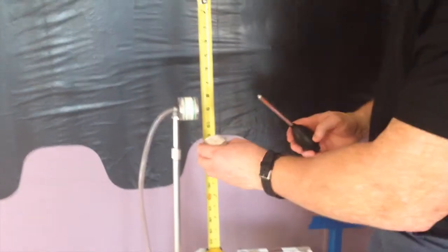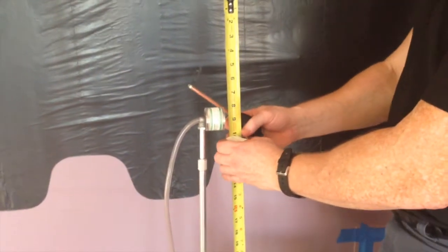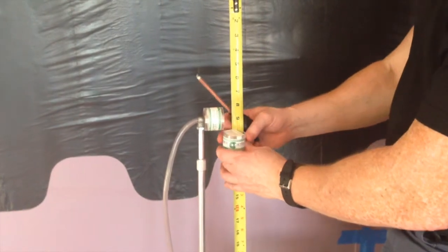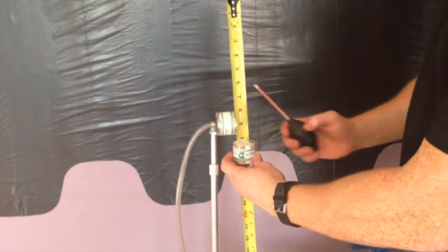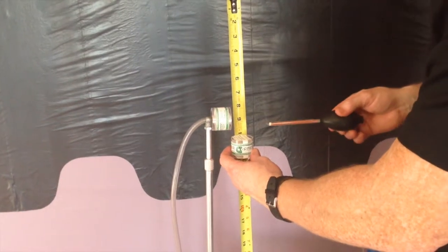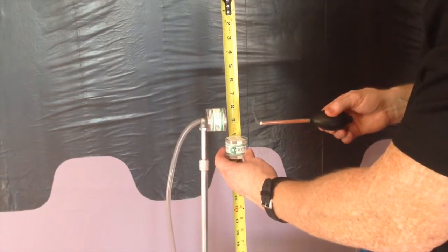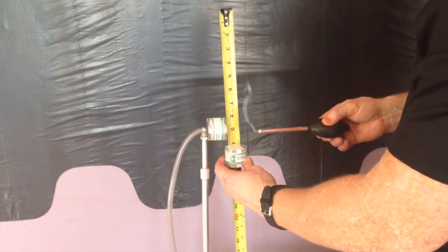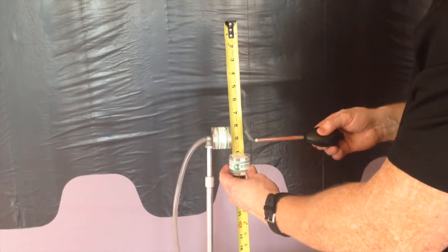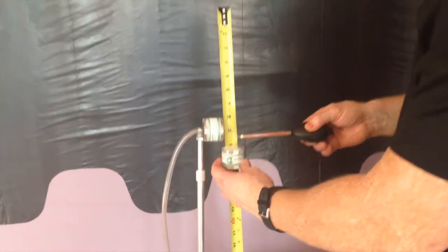Spore traps are useful for looking at rank order comparisons. This is the ranking from the most dominant to the least dominant type of mold in each sample. When comparing samples, marker organisms such as Chaetomium and Stachybotrys are easily distinguishable without culturing. The biggest problem is the lumping together of the Penicillium-Aspergillus-like group.